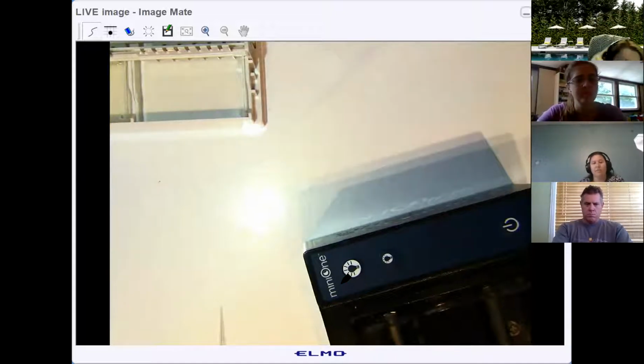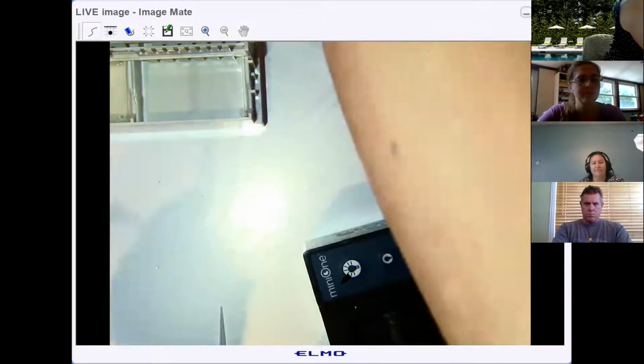Right. Okay. I'm running out of plugs here. I've got to figure out where I'm going to plug in my gel box. Let's see. Okay. All right. Let me put the cord down here.